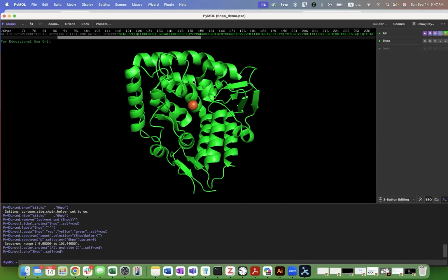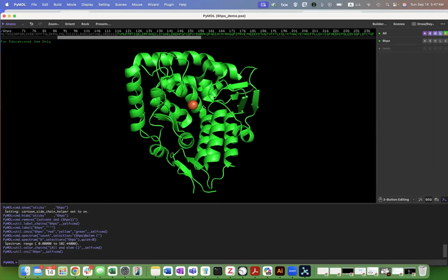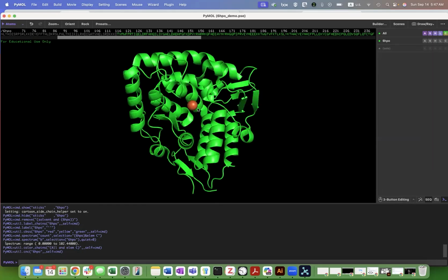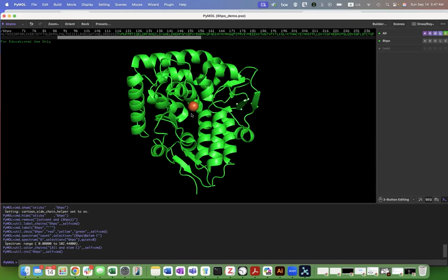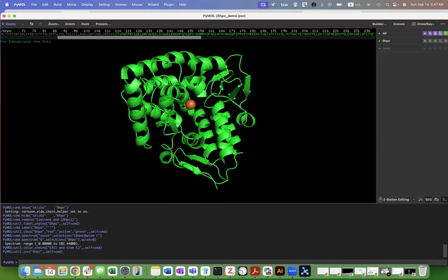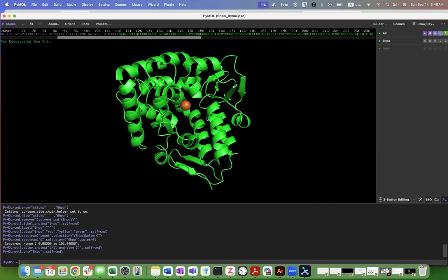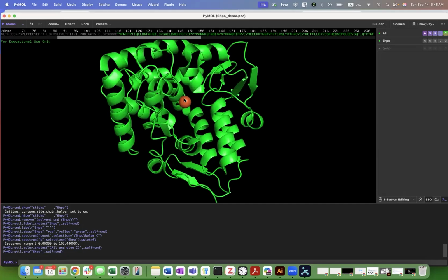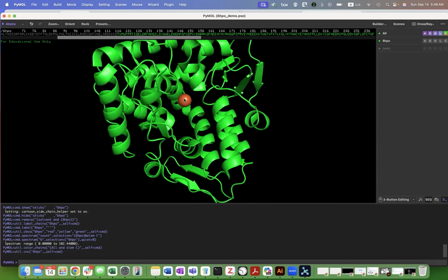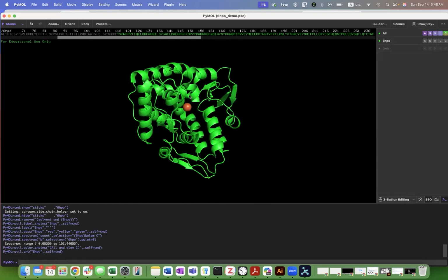So various things you could do, and I'm just going to show you the basics in this one, so I'm not going to go into that. But that's kind of the basics of how you would orient around here. So 2-finger click and rotate your top finger in order to turn things around with your left mouse. If you want to go from side to side, use Option, and you can move things around, and then up or down. Oh, to zoom in, you can just pinch and drag or use your middle scroll bar. So pinch, drag on a trackpad. And then 2 fingers up or down to do that slab.